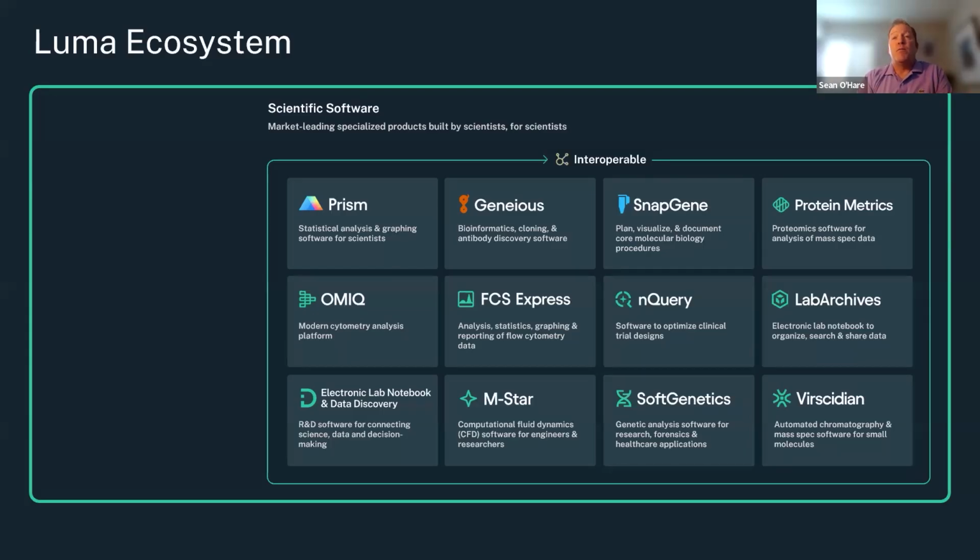And as we brought all these together, we got the opportunity as well as maybe the responsibility to provide a way to link these together into a more enterprise offering. As they exist now, they mostly exist as individual expert tools. Contextualizing experiments that contain these things is really quite challenging. So ELN experimentation over the years has involved some form of arts and crafts where things are pasted together, connected through links, and going back and actually adding context to how experiments actually were run is quite challenging.